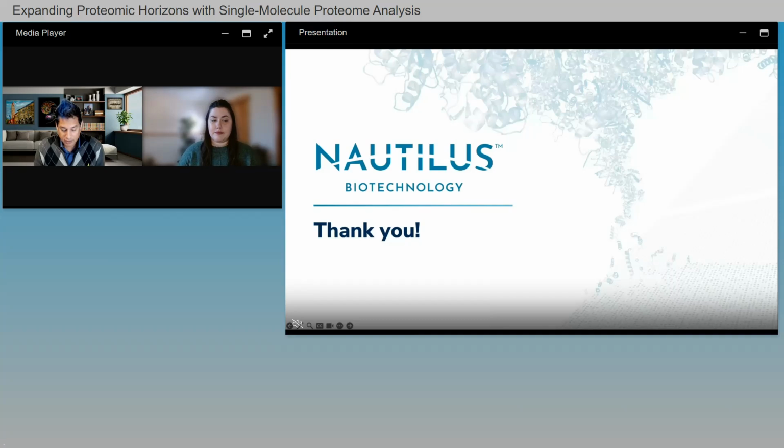I'll just note that we are a little careful with probes that contain lysines, because our sample preparation method preferentially modifies lysines. We're also a little careful with probes that contain cysteine, just because they are so frequently modified. And so while we have been able to generate a wide variety of probes, we are particularly careful about short epitope probes containing those 2 amino acids.